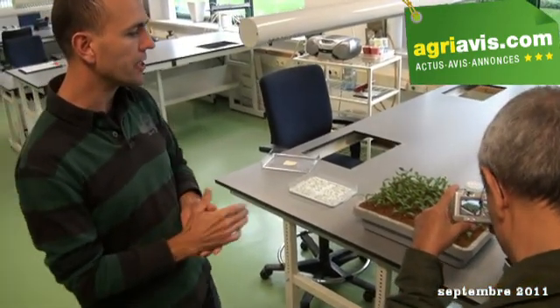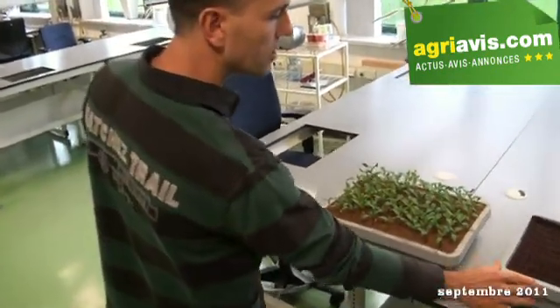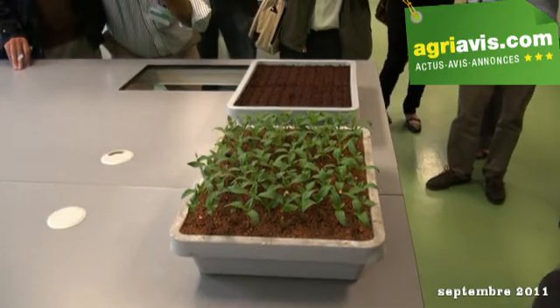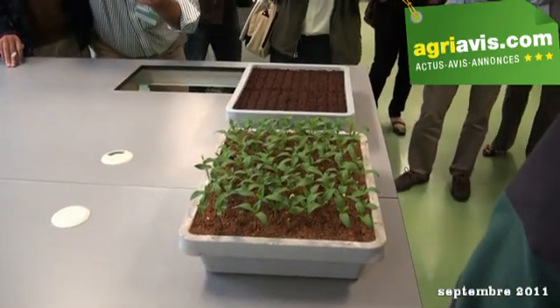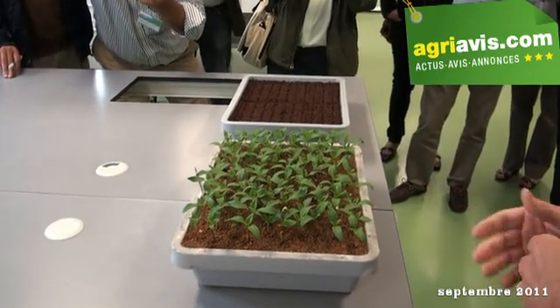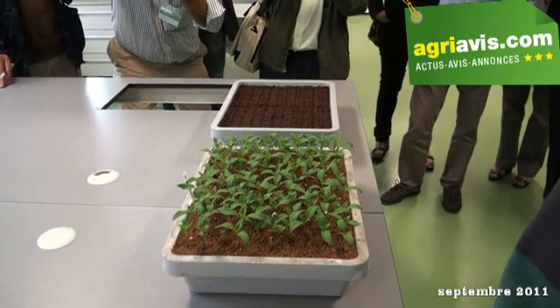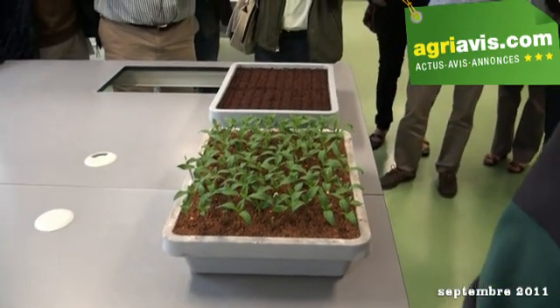Here we have Vitality trays. Vitality is prepared like this for sowing, and after sowing we put them in our grow chambers and they stay in the grow chamber for the whole period until we do the evaluation. This is an evaluation stage for Vitality. What we see here are peppers — you can see the cotyledons and the growing point.